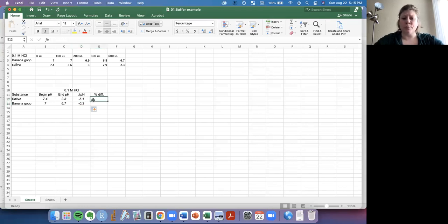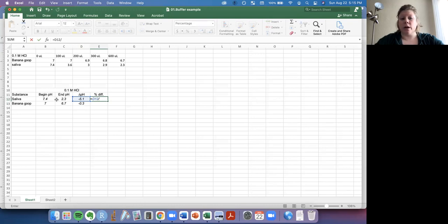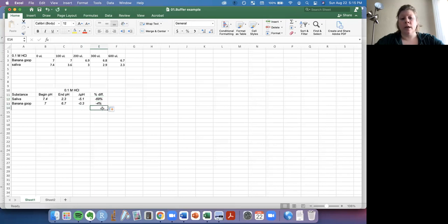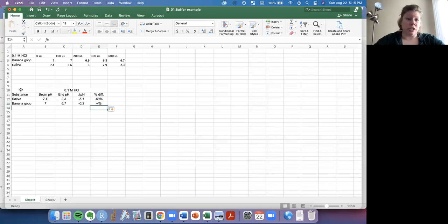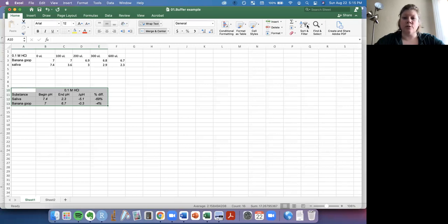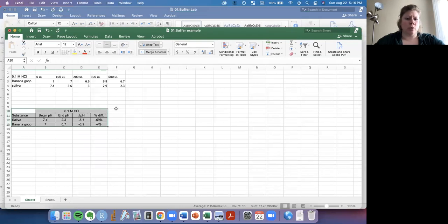And then to do a percent difference here, all we can do is say equal to the change in pH over our starting pH. And again, I'm going to drag down to calculate this one. Terrific. So by using these sort of calculations or a table like this, I'm going to put some borders on this table. I would like to put some borders on this table, all the borders right there.